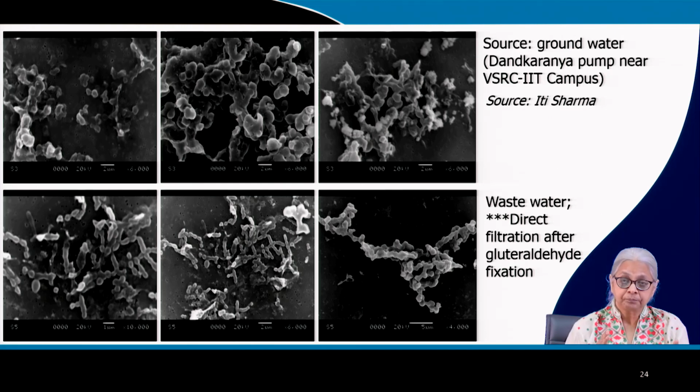differentiate between microorganisms and the organic matrix that may be part of the sample. So you can see in the groundwater sample, there's a lot of organic material as well as inorganic material, and it's very difficult to make sense out of these images.